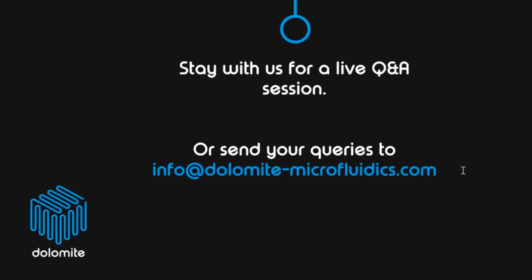I am just going to take one more question because we are running out of time. So how about fouling during continuous production? What are typical production times in the continuous mode? So in terms of fouling, it depends on how long you want to run it for. Most of our components with the system are very robust and reusable. Although in the long term they are consumable and something that you can very easily change, in terms of the chips themselves, the tubing and/or the syringes, usually they are very, very robust and they can last a very, very long time. And it comes down to maintenance as well as robust cleaning regimes that need to happen after every process you run with the system.